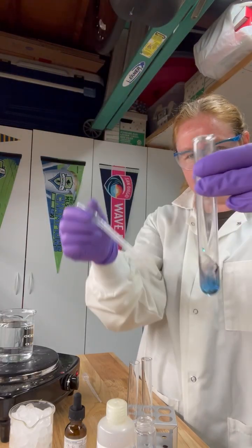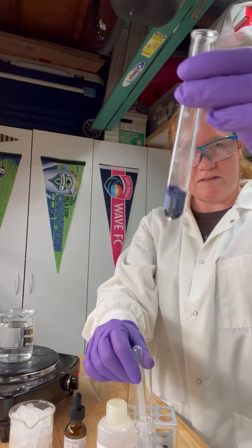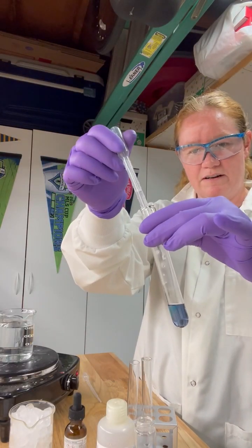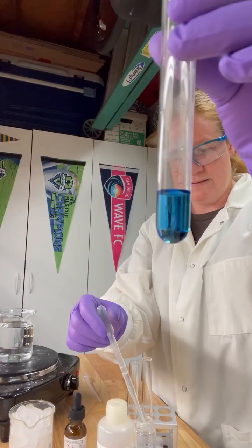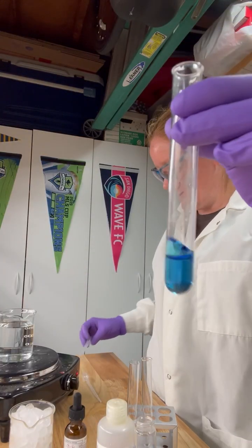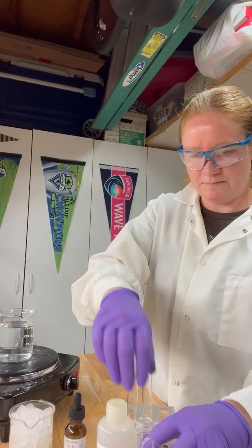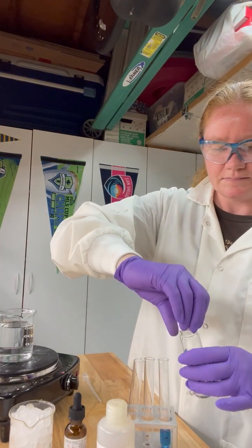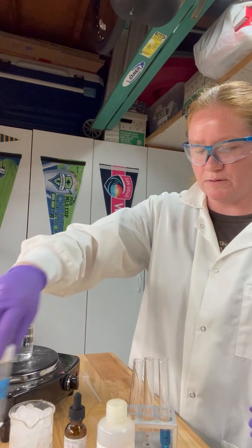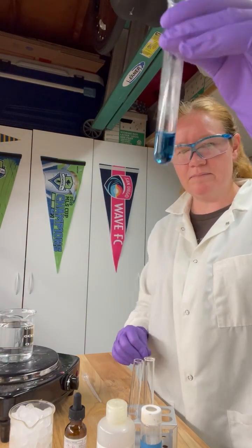All right. Got some good blue. There's a little bit of purplish color going on, which means I've got a mix of both. So I'm going to add a little bit more chloride. There we go. Now we've got a really good blue color. All right, so now we have shifted our equilibrium to the product side.